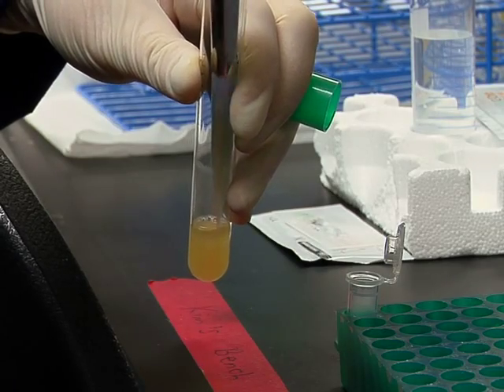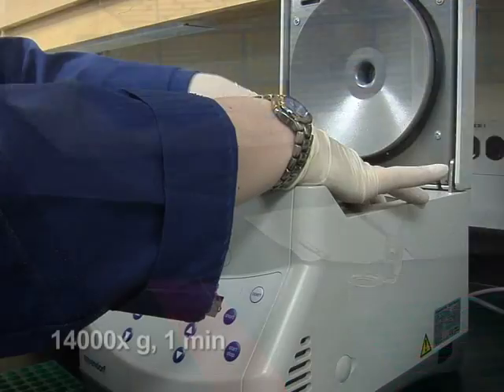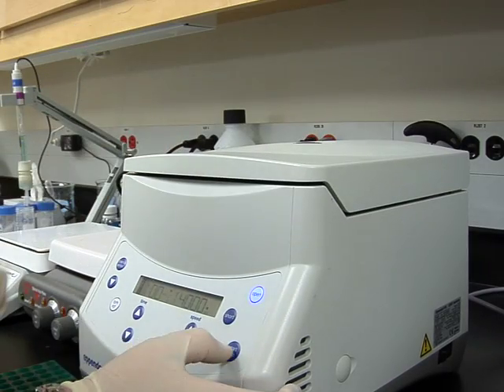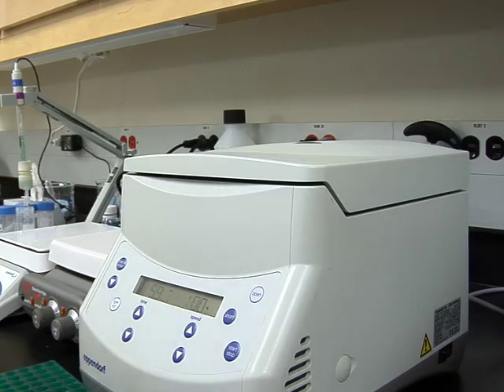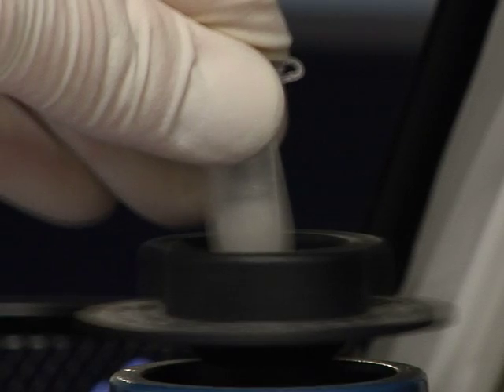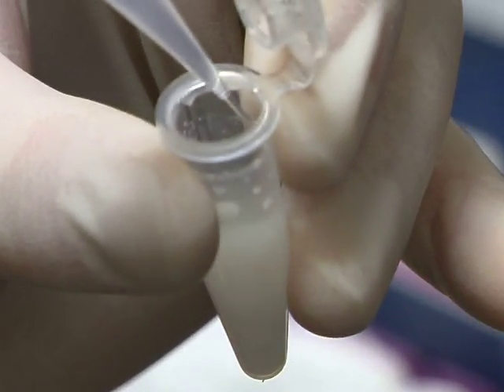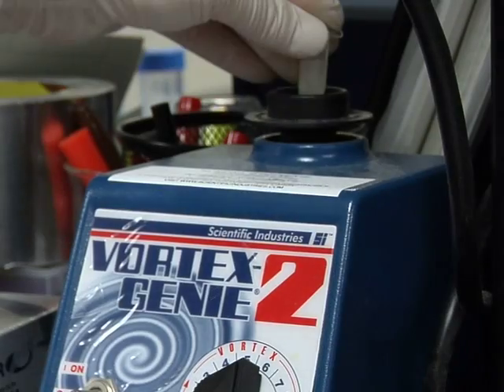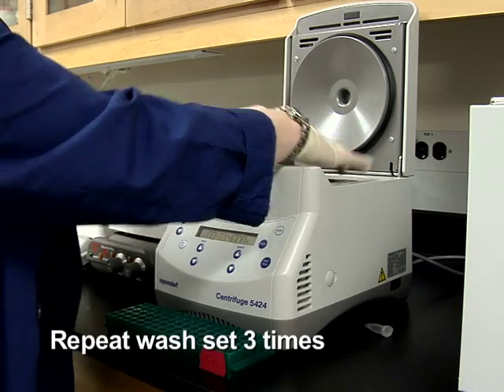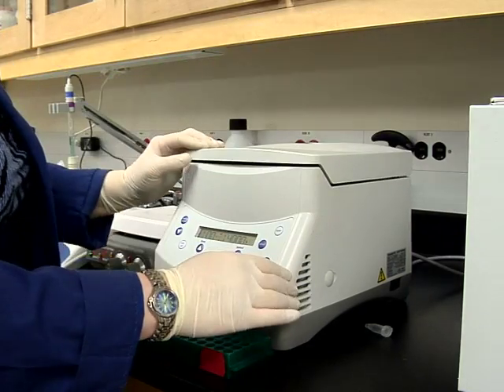The next day, transfer 1 ml of the culture to a 1.5 ml Eppendorf tube and centrifuge it at 14,000 times G for 1 minute to pellet the cells. Then discard the supernatant and vortex the pellet to loosen it. Re-suspend the cells in 1 ml of PBS, vortex and centrifuge them again. Then discard the supernatant and repeat this wash step 3 times to remove any residual culture medium.